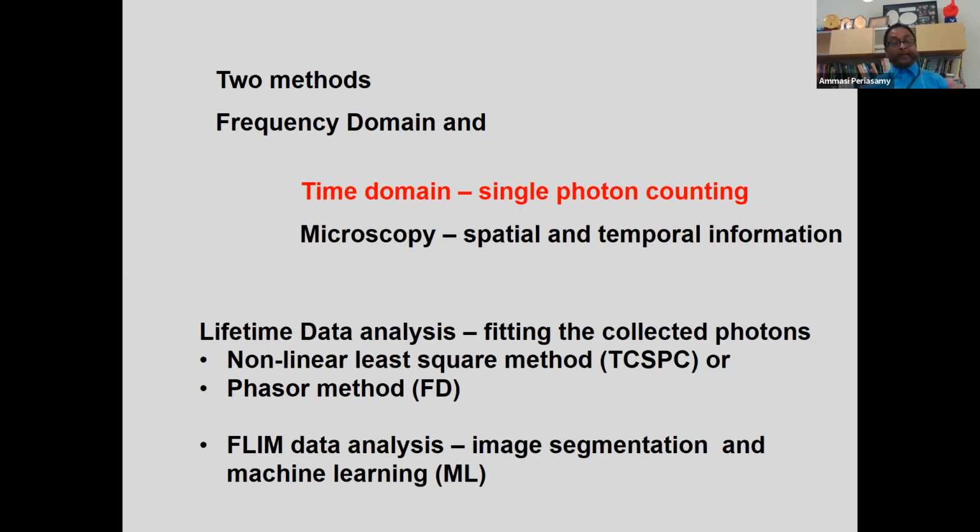So using the data, we developed image segmentation, and then using the number of parameters, we use machine learning to extract information from the collected data.